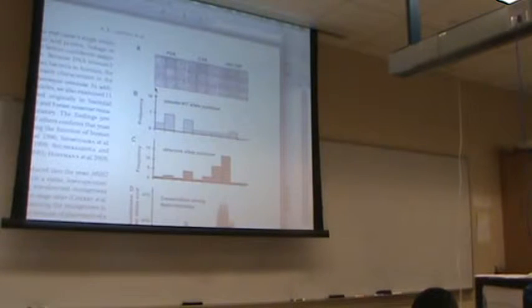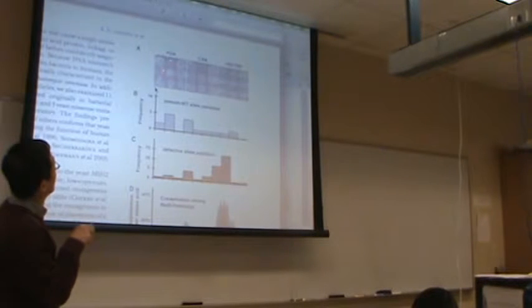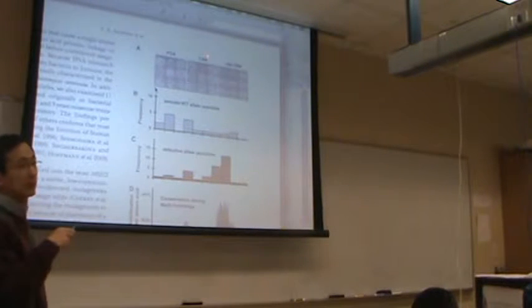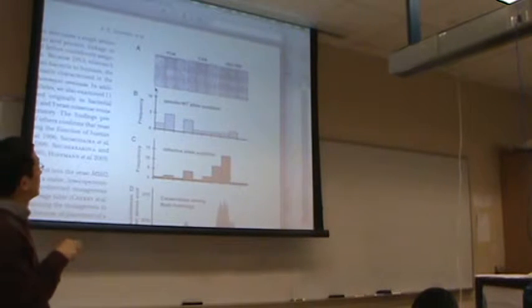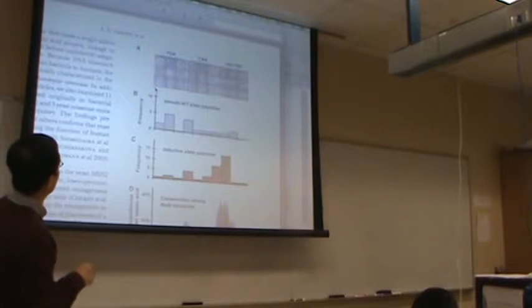Alright, so this is what we are going to do. This is the figure we are going to do today: FOA assay to measure the function of various MSH2 mutants. This is part of your reading assignment from early on.